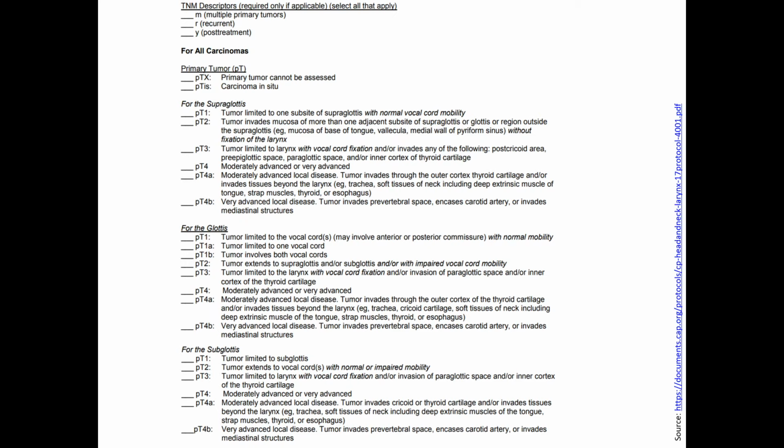Oh, thyroids. So thyroids, gross. This is very important, and I say this because I do thyroids, and I am very much in the camp of not submitting entire thyroids. That's not how I do thyroids. However, gross them the same as you would a normal thyroid. And if you find something that looks suspicious, put that in as your representative section. It might mean that we go back later, or if you want to put 2 or 3 in, you can.